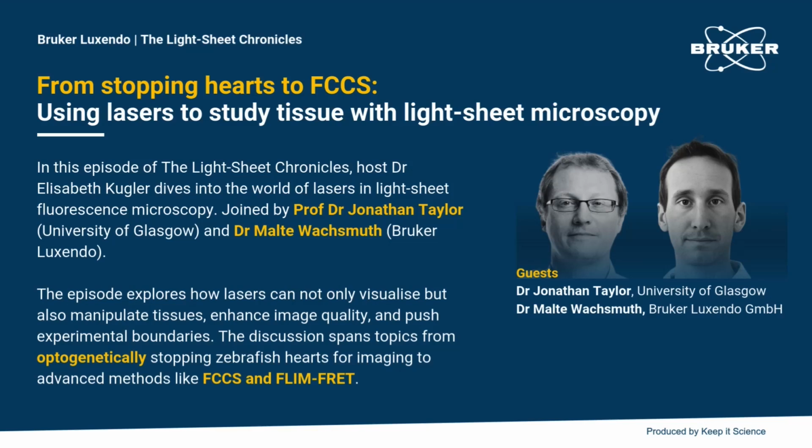So we had to develop our technical approach to computationally freeze that motion to enable us to see stable three-dimensional images over time. The way we were able to do that was to image continuously in a bright field channel and monitor in real time the motion of the heart, which enabled us to then make real-time decisions as to exactly when to trigger individual fluorescence images to give us a stable image, as if the heart wasn't beating at all in the fluorescence channel. But of course, we know that it is constantly beating. It's just through our stroboscopic timing of when we capture the fluorescence that we were able to get that stable image and that series of stable images over time.